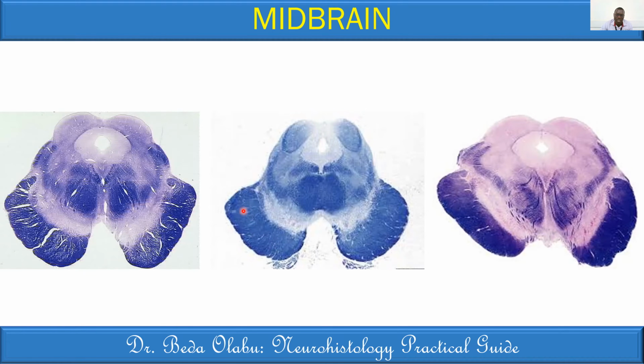The 2/3 in the middle is the one that carries the pyramidal system. Remember, pyramidal can either be corticospinal or corticonuclear. Corticonuclear targets the nuclei of cranial nerves number 3, 4, 5, 6, 7, and nucleus ambiguus and the hypoglossal.